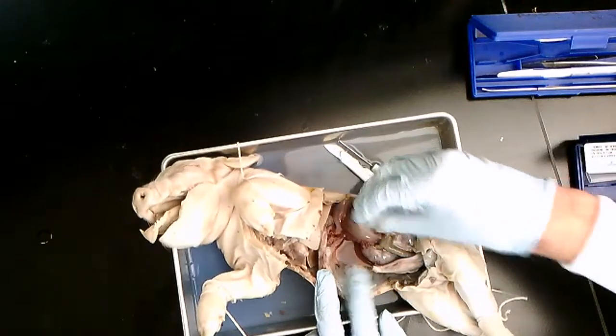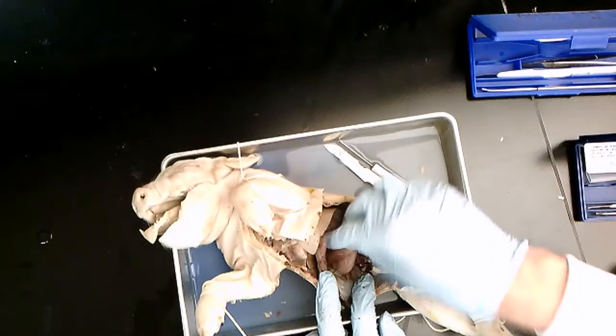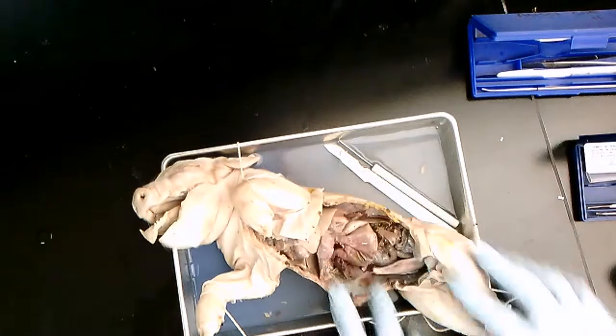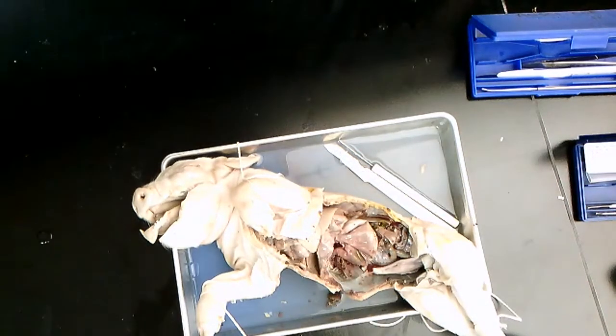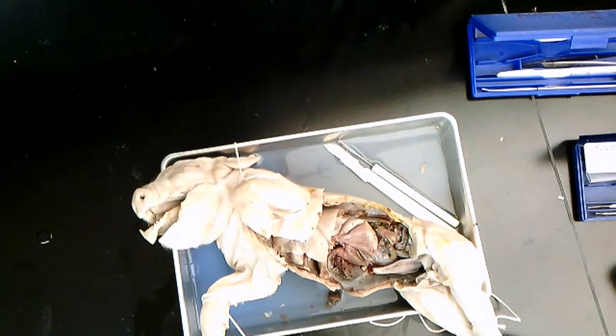What about lobes of the heart? Would they be asked to identify? I was not planning on asking. Okay, for the lobes. Or ventricles, I guess I should say. And I'll put a list online of all the things you could be asked for.